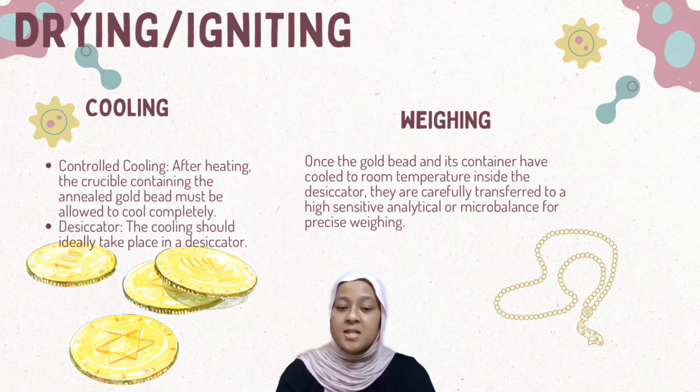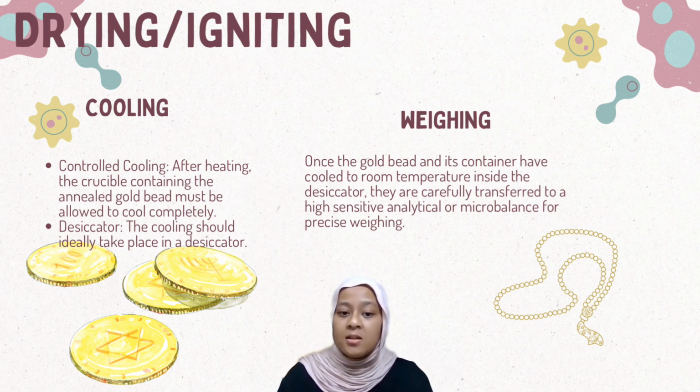By following this careful annealing procedure, analysts ensure that the measured weight truly represents the pure gold content, free from any interference from moisture or surface contaminants.